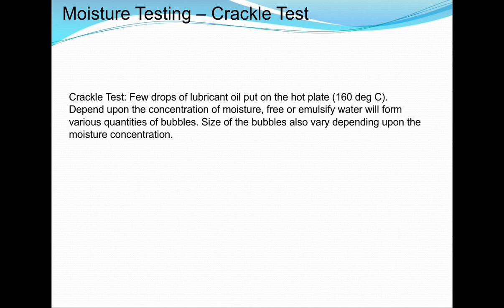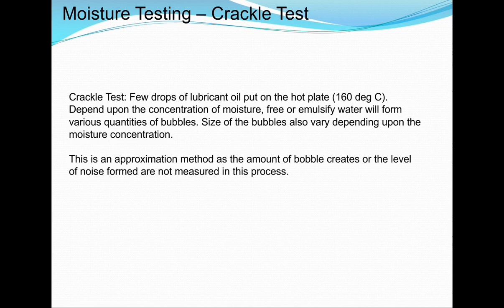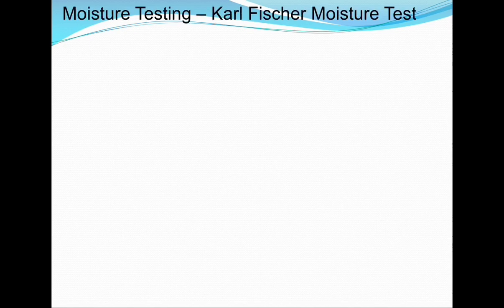So this is basically a heat and trial method. If there is more water in the oil, then definitely the sound will be more and the bubble formation will be more. But we can't say the exact value of the moisture in ppm or ppb in the lubricant oils. Next we'll discuss the process which is the most used in industries nowadays: the Karl Fischer moisture test.